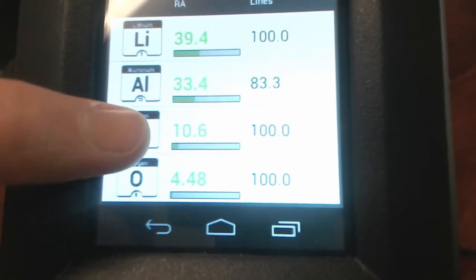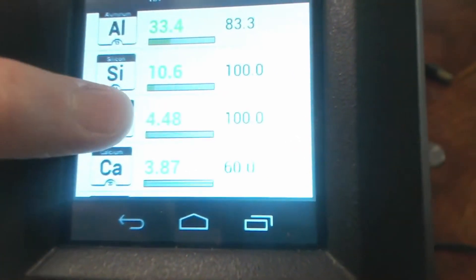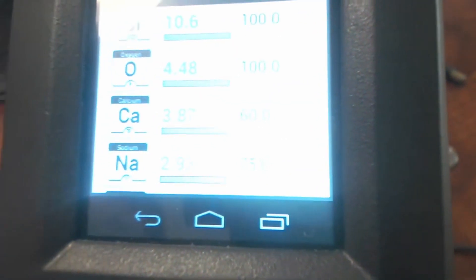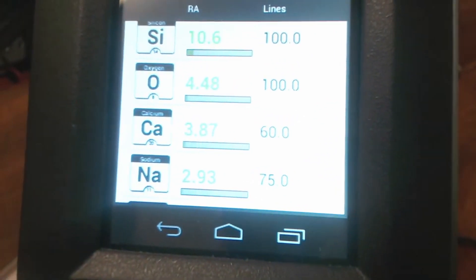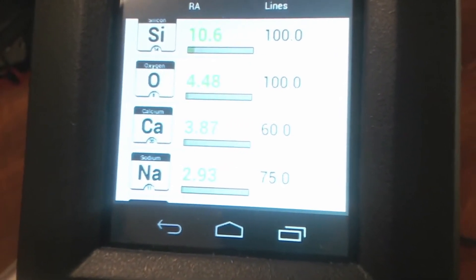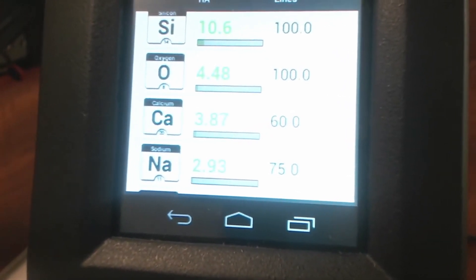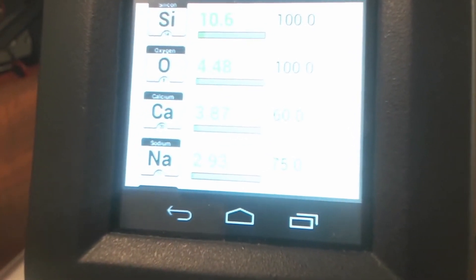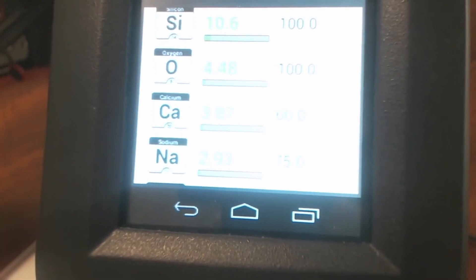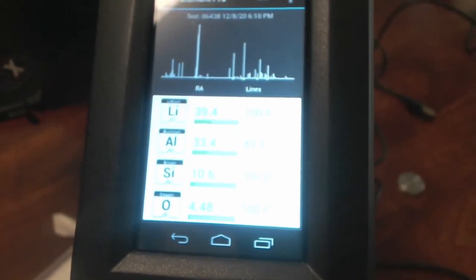Notice that we've also detected oxygen in this sample — one of the best things about LIBS is you can measure these light elements like lithium and oxygen that you couldn't detect before. We also see a fair amount of calcium and sodium in this result. Even though those may not be part of the mineral makeup, they're common surface contaminants and super strong responders for LIBS. We'll see calcium and sodium in almost anything. So that's a quick look at what the Element Pro app does.